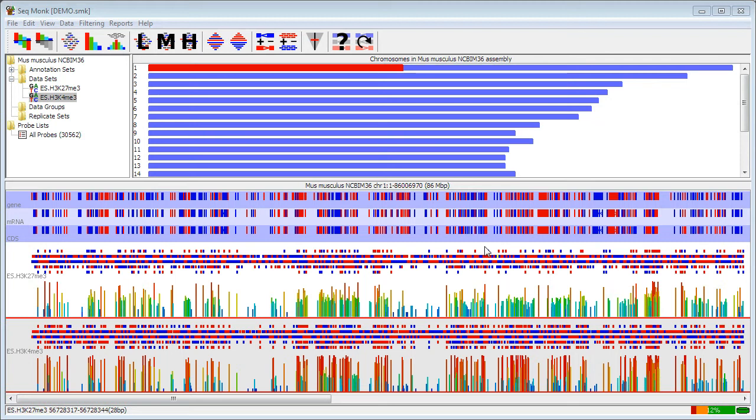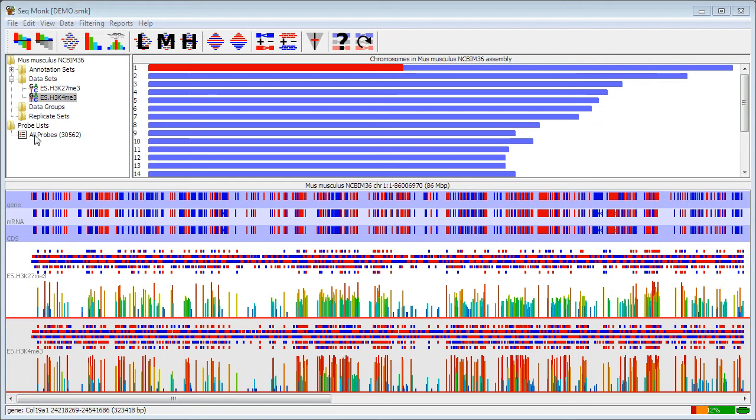Filters apply to the current probe set and the current quantitation. What you do with a filter is essentially you take a starting list of probes and you filter it to get a subset of that list. As you make filtered lists of probes, they will appear in the probe lists folder of your data view here, in a tree fashion, so that each new probe list will branch off from the probe list that it was created from.